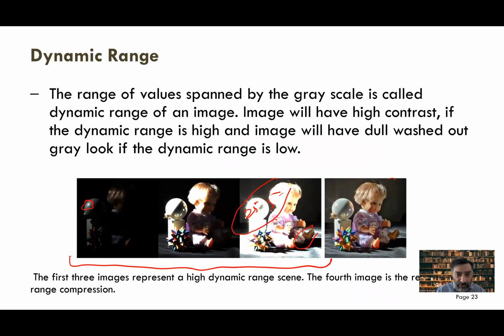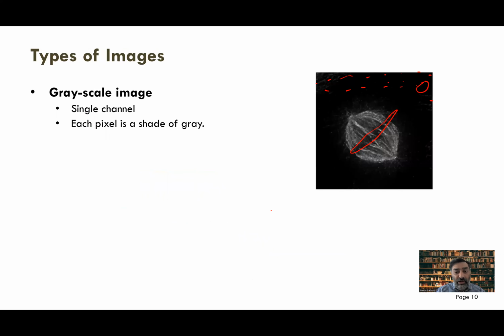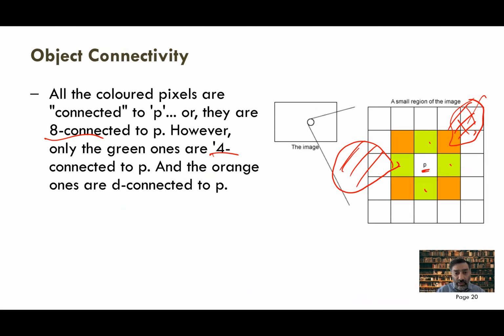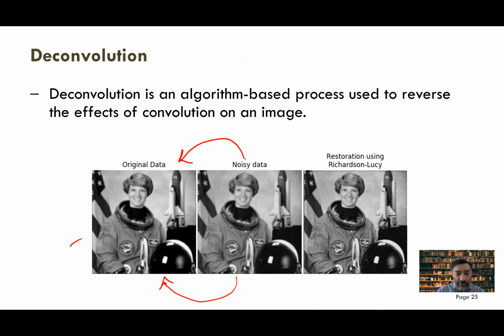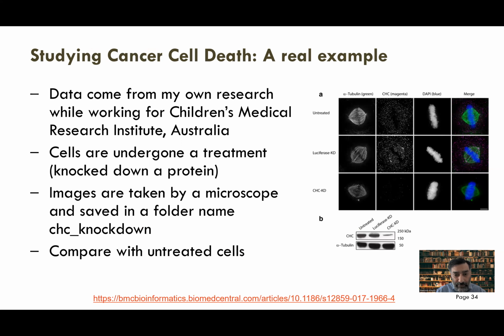I'll show you when we jump onto the Jupyter notebook, these images are underexposed, but we were still able to work with them. It happens. Sometimes you can't solve an issue experimentally, but you get what you get and you work with it. We were able to salvage the images from these underexposed situations, and we'll look at that in our Jupyter notebook shortly.